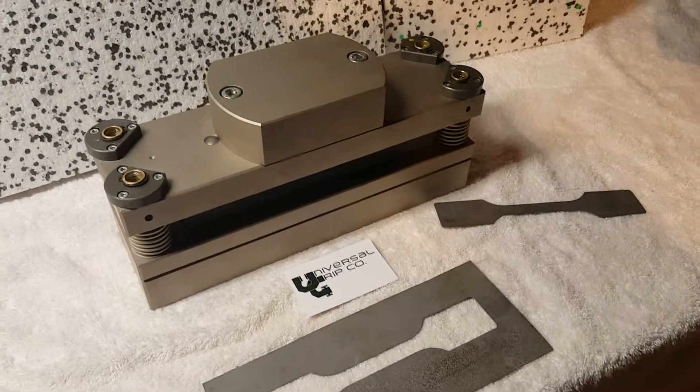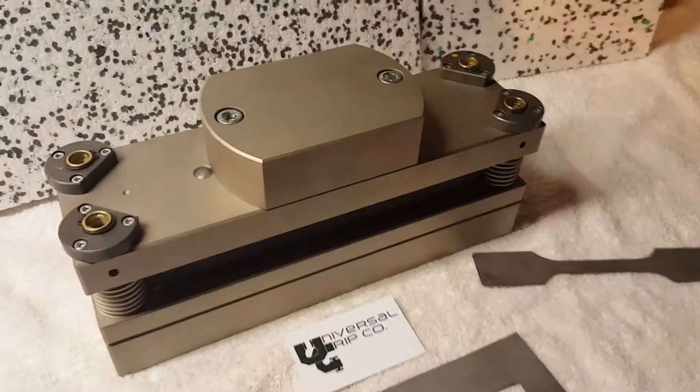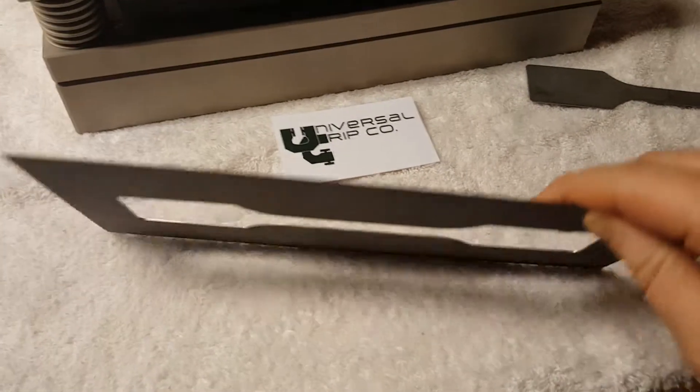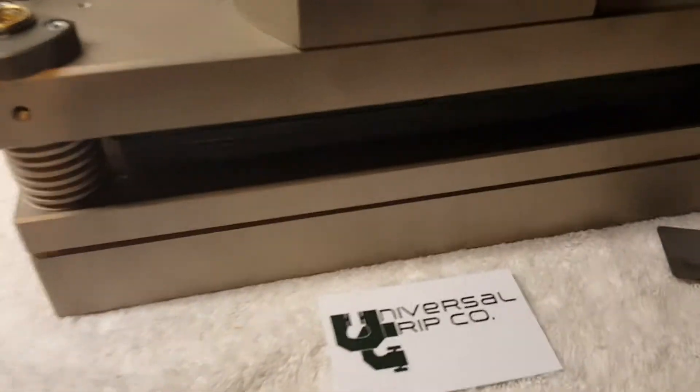Hello everyone, today we're showing our heavy steel cutting die. This is used to cut ASTM and ISO samples. Here, for a sample, I have a piece of cold rolled steel that is about two millimeters in thickness.